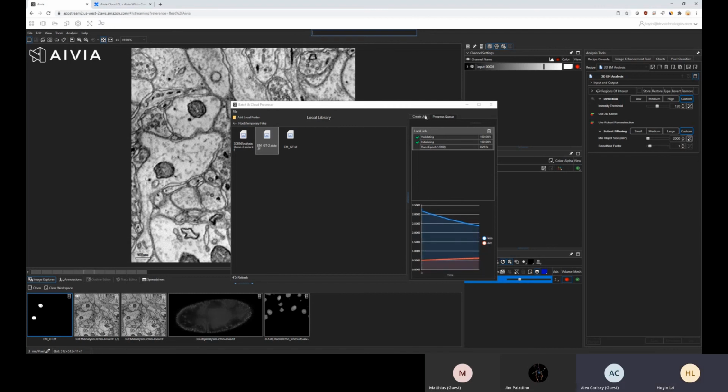In my experience, the restoration is a lot more forgiving compared to the segmentation model. In segmentation, a lot of times you'll need maybe 10 or 20 fully annotated images. For restoration, if you can get 10 pairs of data, you should get a pretty good result.